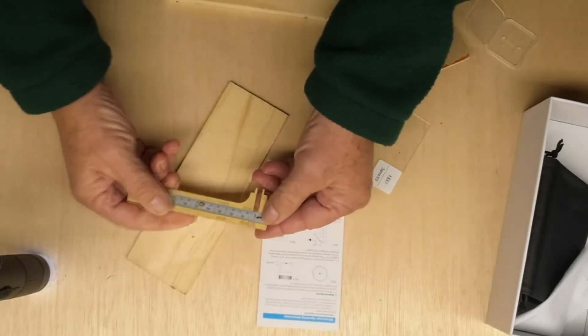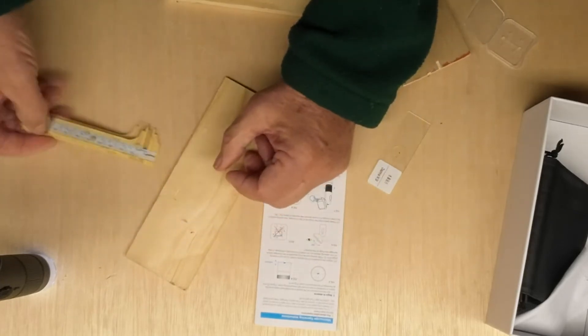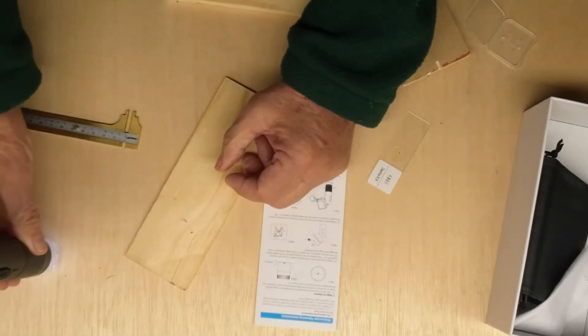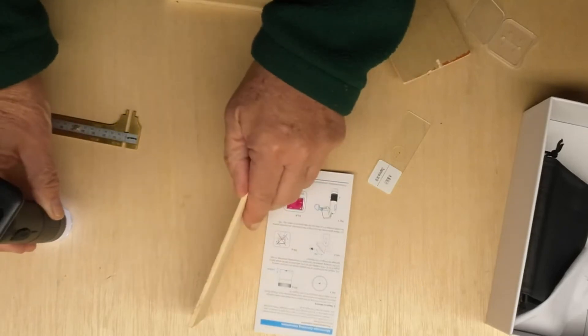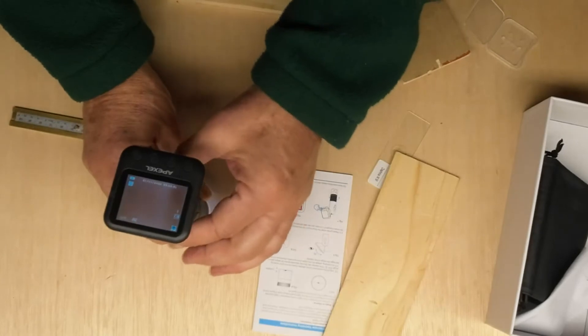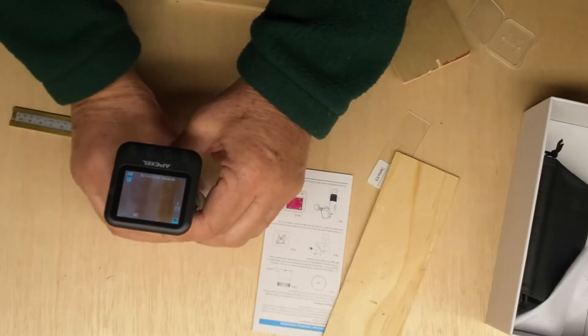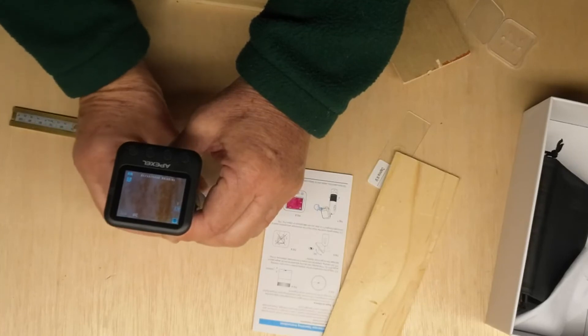Using my little measure here, I found that was four millimeters. So you basically have to be within four millimeters, which isn't very far, to be able to focus. It works best if you just put it down right on the surface, crank the focusing ring around, and there you go.